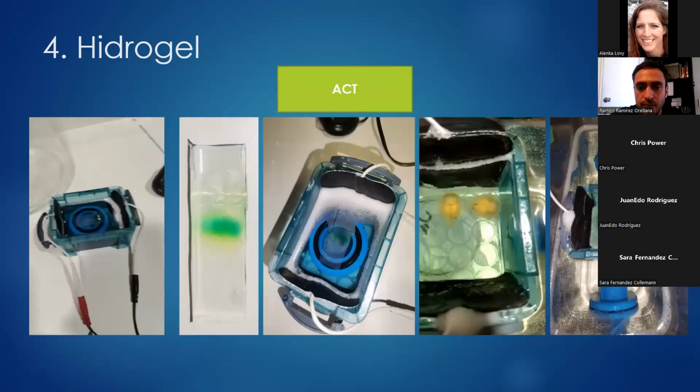También diseñamos un sistema de electroforesis que funcionó bastante bien, y cambiamos los electrodos de platino por unos electrodos de carbono, ¿ya? Que no generan calor, que era uno de los problemas de los electrodos de platino, que generaban demasiado calor y quemaban la muestra. Y funcionó súper bien, acortando los tiempos en comparación con el Clarity pasivo. ¿Ya?